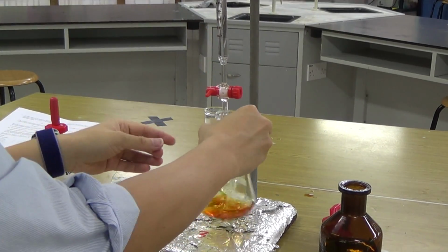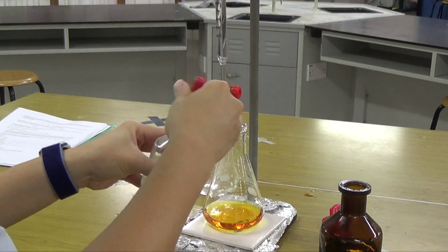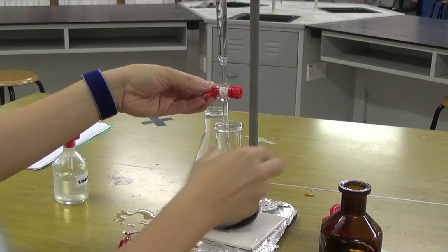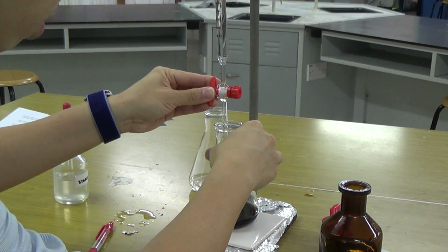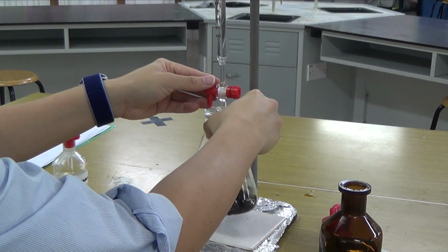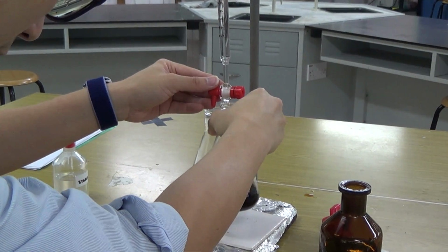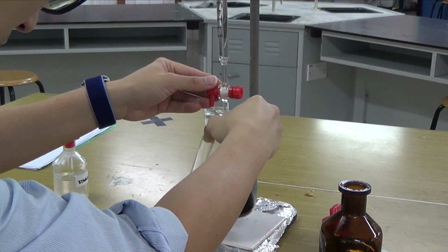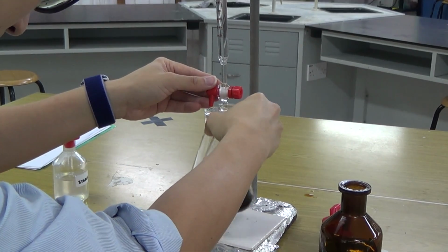Okay, so it is still a bit yellowy, yellow solution, because there's still some iodine left in there. What I'm going to do is add the starch indicator, and here's where I need to be careful and do it drop by drop. So get your drop by drop, really drop by drop. It's going to take practice and time. It will be slow, but you want to be as accurate as possible, so you don't go full speed, you just swirl gently. Doesn't take much, I think. It is slow, very slow actually.